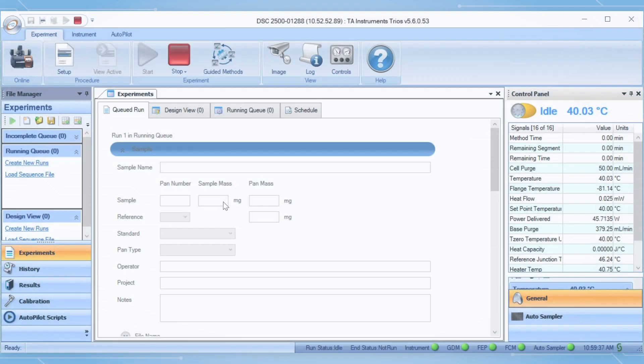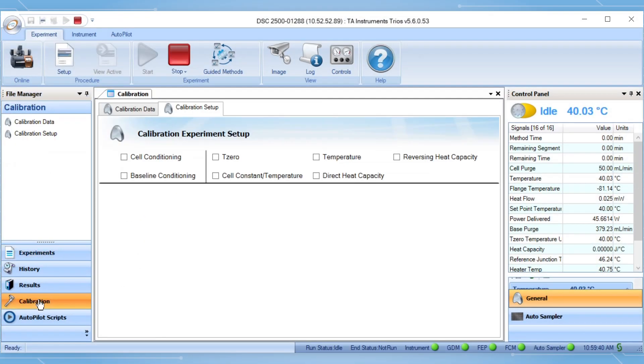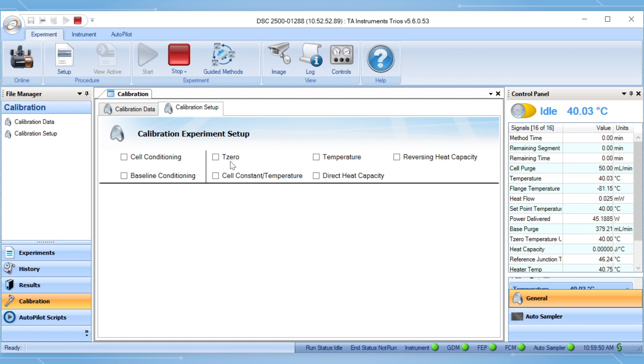In TREUS, select the calibration tab from the file manager on the left hand side. Once the calibration window is open, select the calibration setup tab. Remember you need to perform baseline calibration prior to cell constant and temperature calibration.